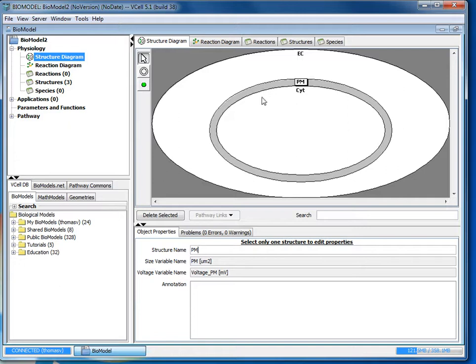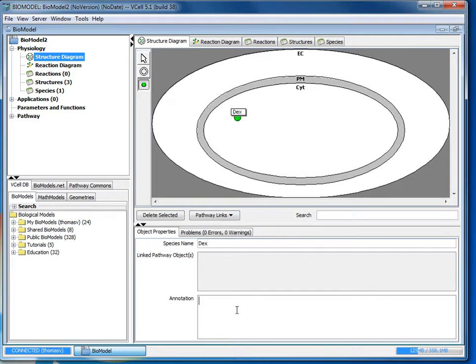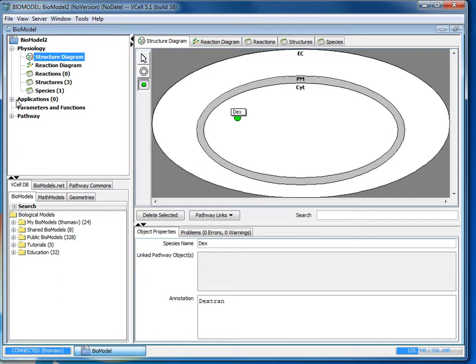So now we've created the cell and we need to create the species. We'll click the species tool and click within the cyt region and it will create a species. Enter dex for its name and in the annotation field enter dextran. So now we've created the structure and it's time to move on to creating the application.